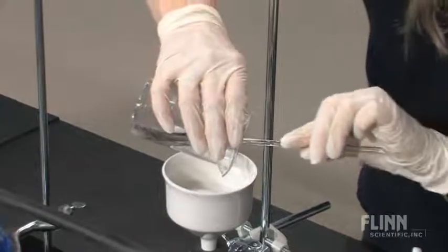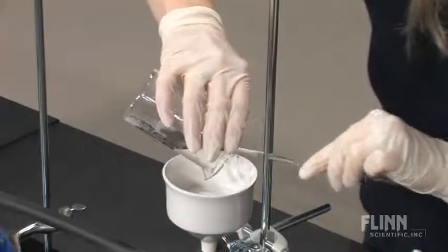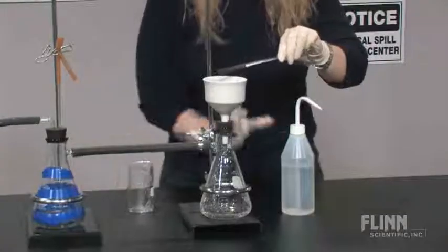Use a rubber policeman to transfer the rest of the solid into the Buchner funnel. Transfer any remaining solid by rinsing all materials with the solvent, which in this case was water.